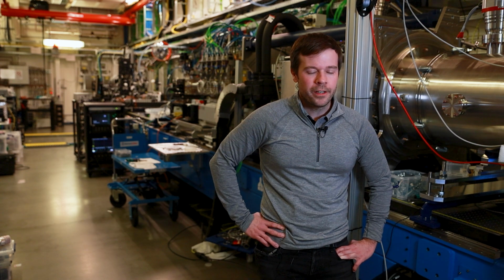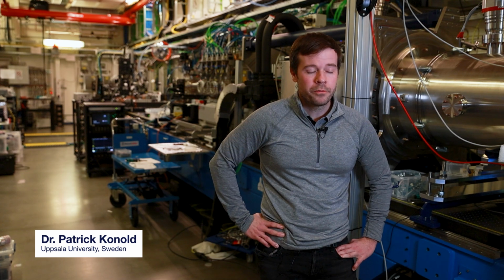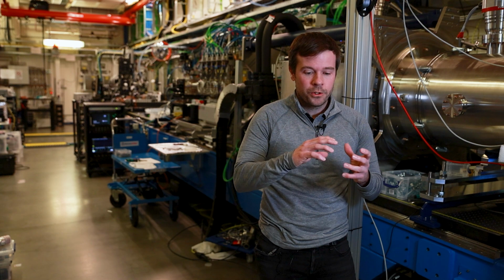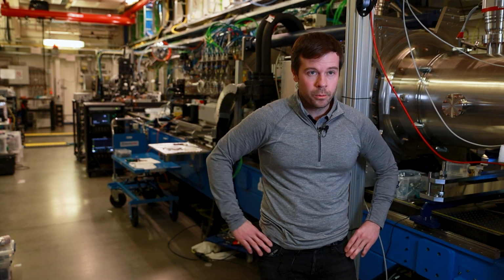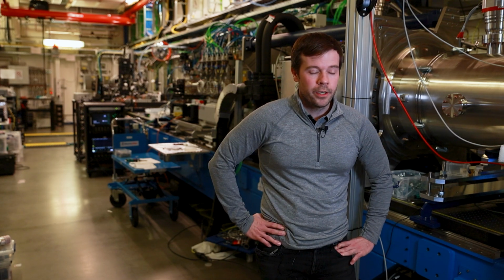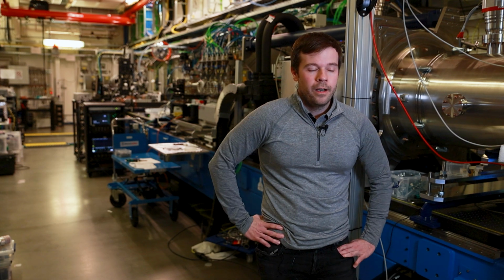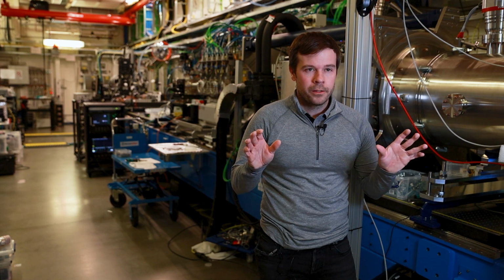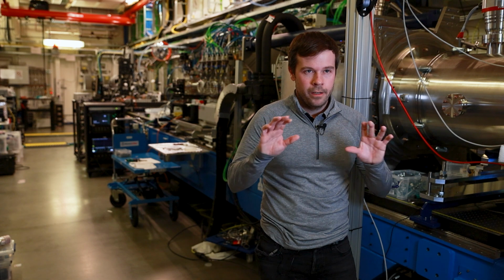So we're interested in structural functional relationships in protein, and specifically light-activated proteins, which undergo large conformational changes in response to light absorption. So in this experiment, we're interested in a light harvesting antenna complex from Cyanobacteria. And these antenna complexes are extremely important for regulating how much photon flux reaches the photosynthetic reaction centers.